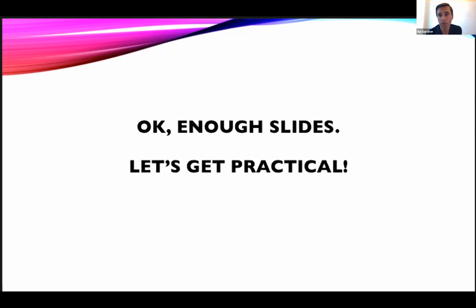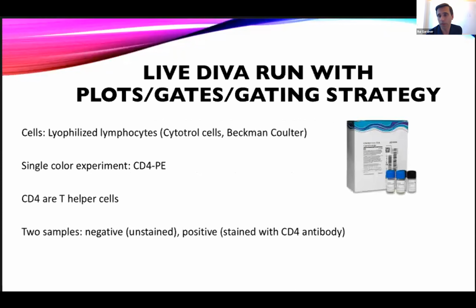Mm-hmm. Yeah, it's important to also note that in terms of the voltages that one is going to use afterwards, there's this thing called application settings that can be used by Diva that will take that information and adjust voltages. But that's going already more into detail. What Kathy was showing here is more QC performance check, right?